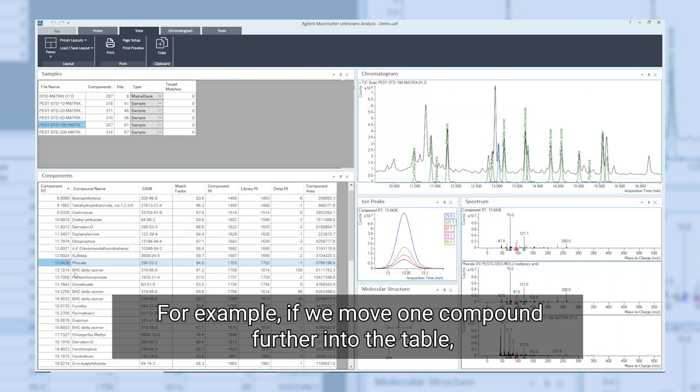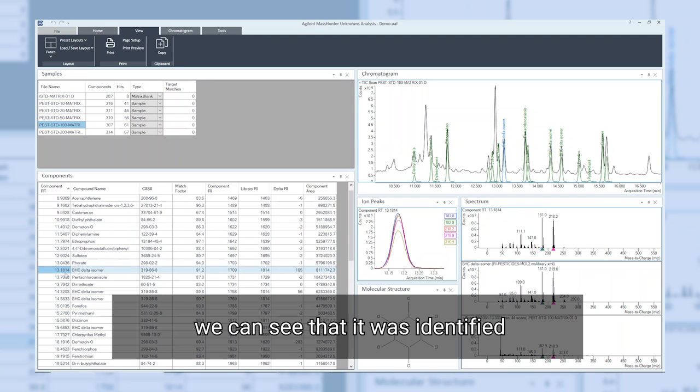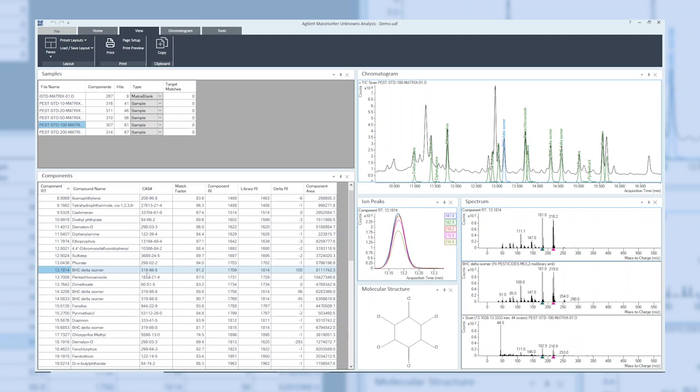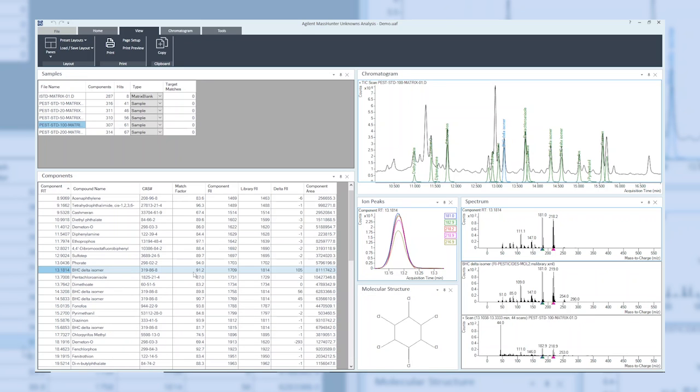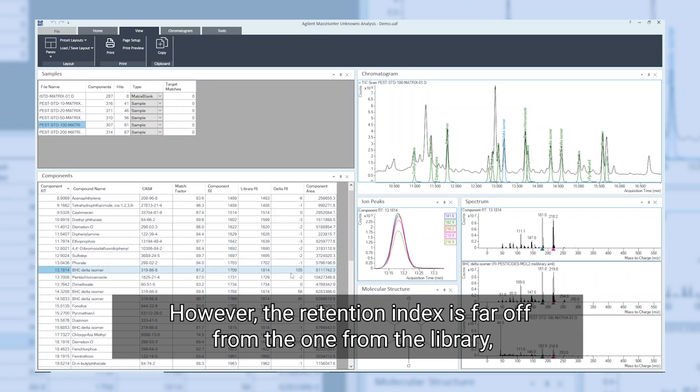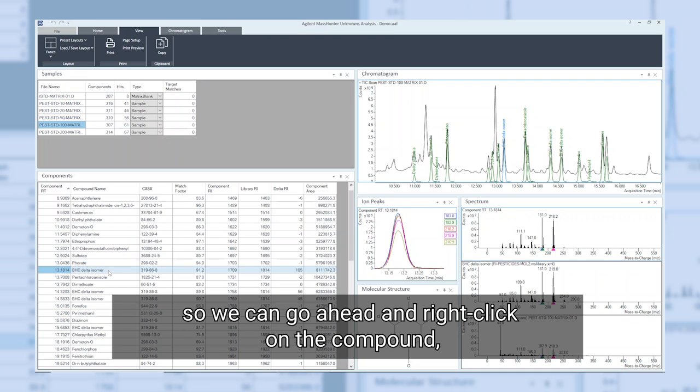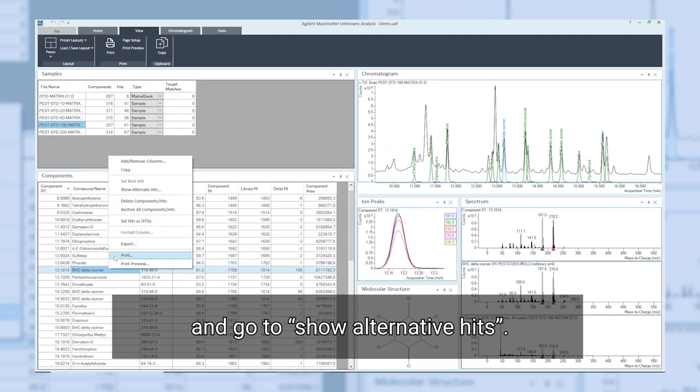For example, if we move one compound further into the table, we can see that it was identified as the delta isomer of hexachlorocyclohexane. If we look at the spectra or the match factor, we can see that it's quite good. However, the retention index is far off from the one from the library.